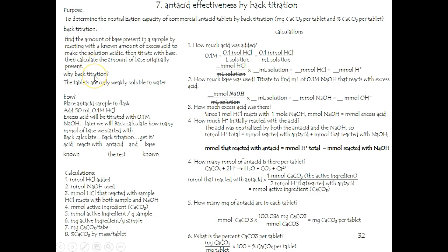Why on earth would we do such a weird procedure? Because the antacid tablet that contains chalk won't dissolve well. Chalk does not dissolve well in water at all. So this is a trick that you can get it to all go into solution and then measure how much chalk would have been there by this back calculation.